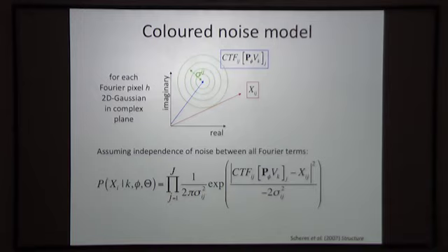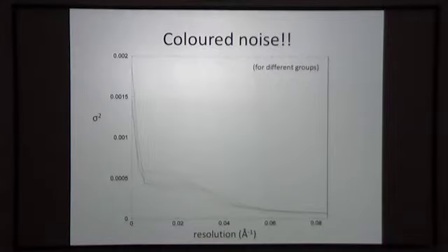We can make that a function of the actual spatial frequency of the images. And that allows us to model the fact that in our experimental micrographs, everything becomes smaller with higher spatial frequency. So the noise drops with spatial frequency. Unfortunately, the signal drops even faster, so the signal-to-noise ratios drop. But noise is not white at all, and we'll be allowed to model that better.